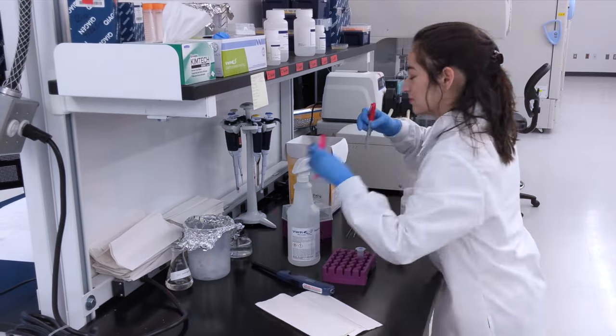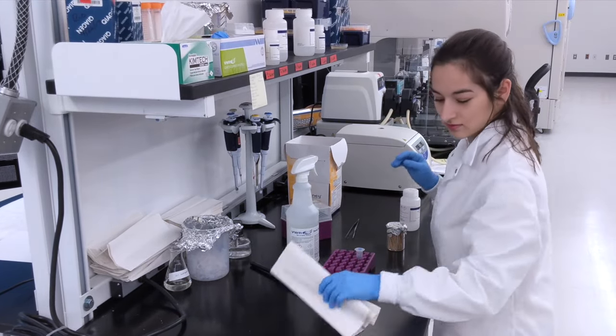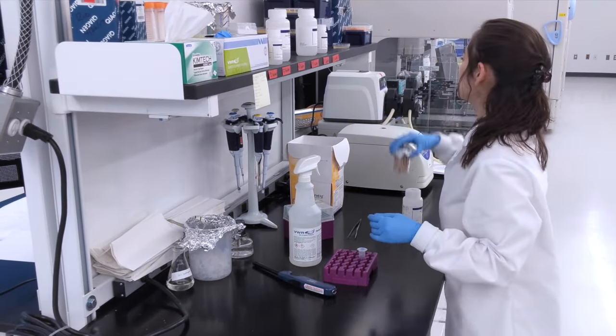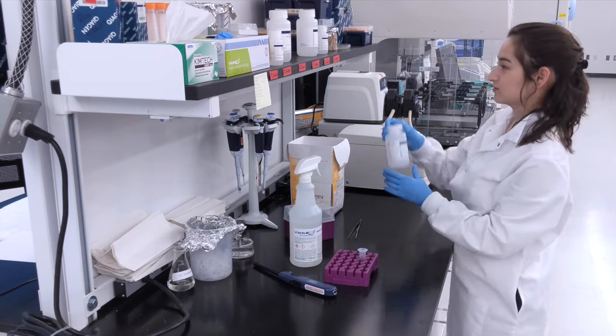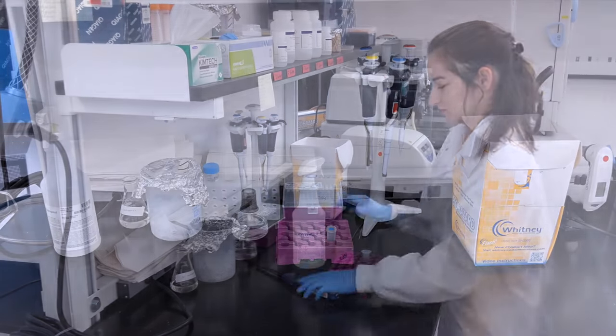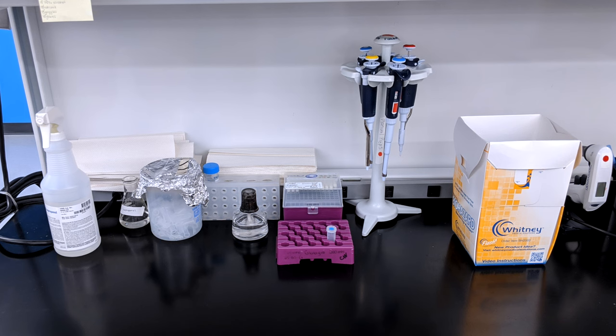Before beginning any task, clear the workspace of unnecessary materials. Set up all materials so that they are in arm's reach with clean and dirty items clearly separated. We recommend working from left to right with all clean materials stored on the left and waste bins to the right.